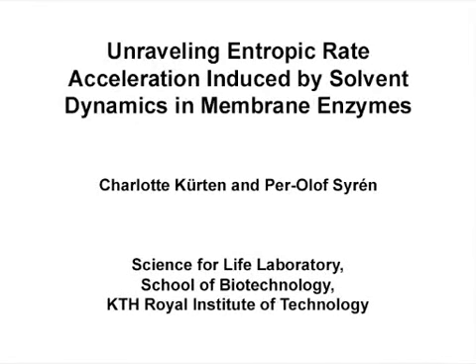The overall goal of this interdisciplinary protocol is to enhance our fundamental understanding of the impact of solvent dynamics on enzyme catalysis. This method can help answer key questions in the biocatalysis field, such as how solvent reorganization drives enzyme dynamics and catalysis. The main advantage of this technique is that it allows for the engineering of tunnels, or motifs of water transport, which affects specificity, activity, and thermodynamics.